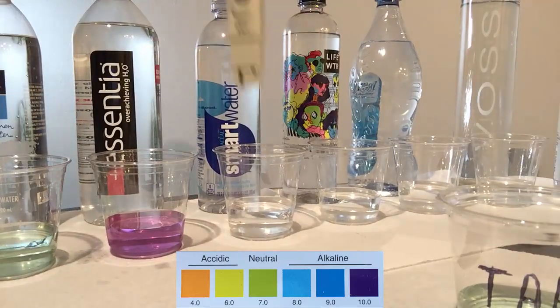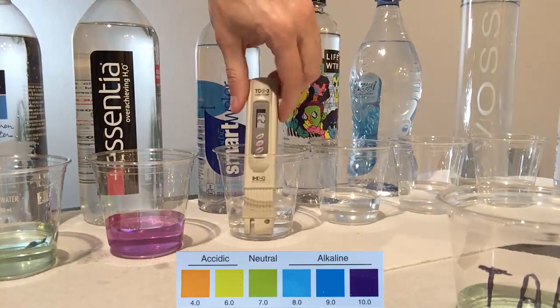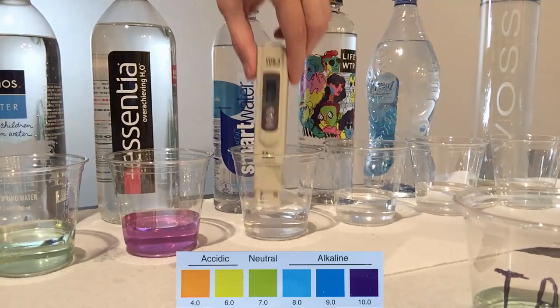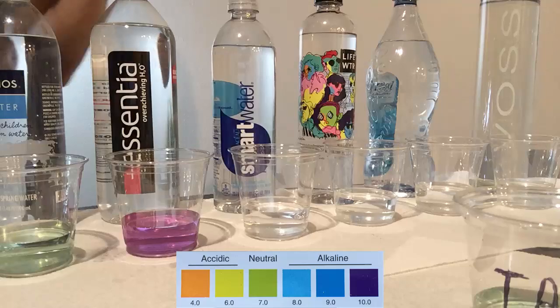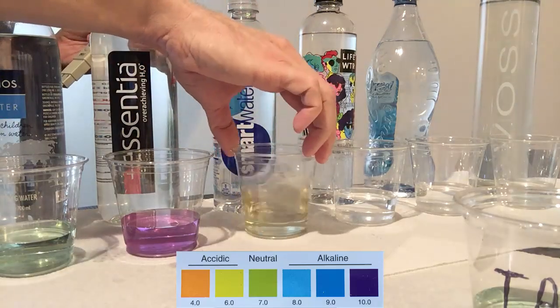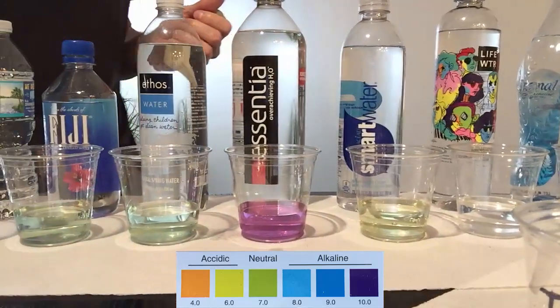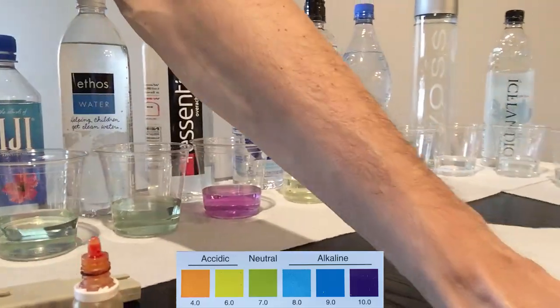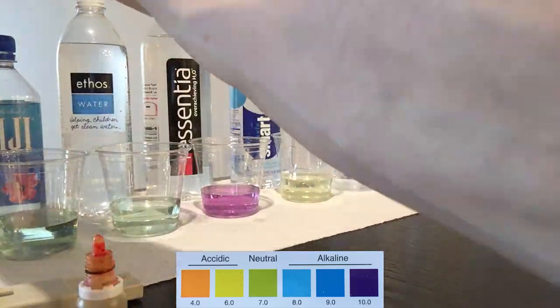The next one is Smart Water, which has been vapor distilled and then had some electrolytes and minerals added for taste. At a TDS of 23, this is the lowest reading so far. The water stays yellowish, so it's on the acidic side. They need to add a little more minerals to the water to make it not only clean but also alkaline.